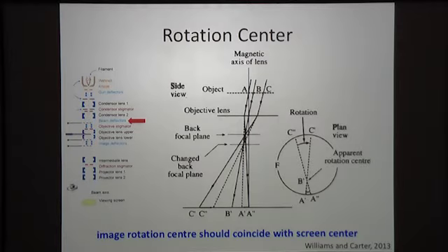Now this is a sort of a rough alignment, and it's good for medium resolution work. Sometimes you can get it quite accurate, but it was figured out that this wasn't sufficient for high resolution work. So the next step, and just to remind you what you're changing here: when you change the beam tilt, you're using the beam deflection coils to change the beam tilt. In the next step, you're doing the same thing. You're changing the beam tilt again. You're just doing it a different way. The microscope sets up the conditions a different way.